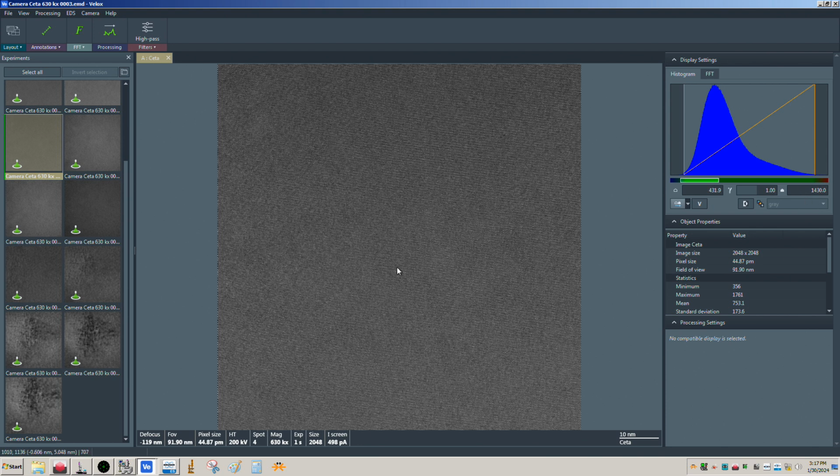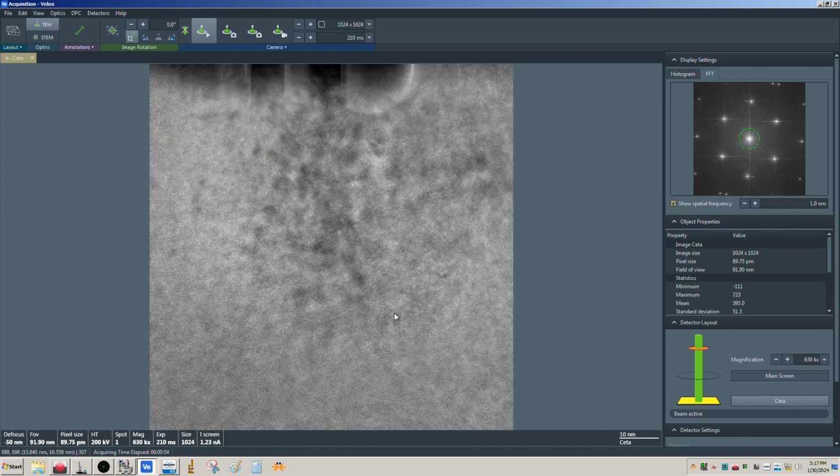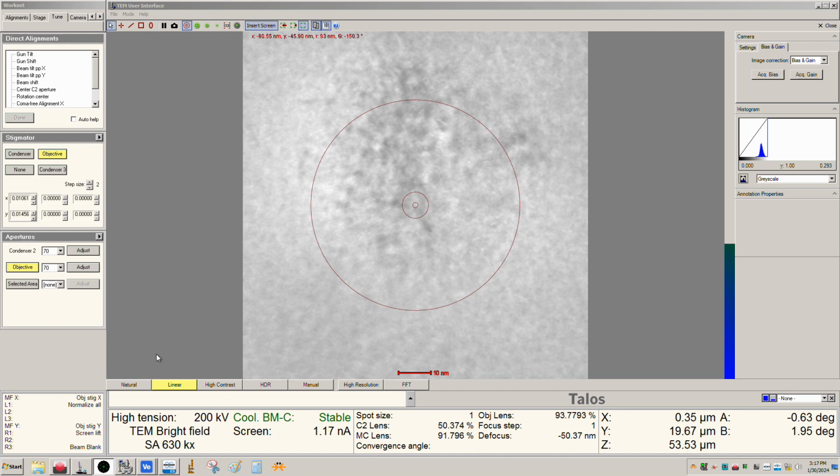Again, the beam might not be spread out exactly the same in both cases, but that is the trade-off in terms of signal to noise. But again, even at this lower dose, and this lower current dose rate here, I'm still getting what's very much a workable image here and a good image, okay? So the takeaway I have from this for you, right, is try not to cook your samples, okay?